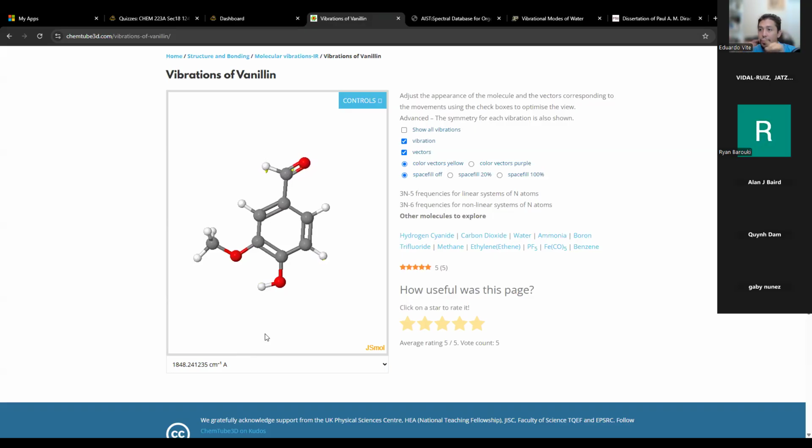And so when we look at the chart, we look at the values of those specific energies and we see if there is a peak. And then what kind of a peak? Is it a strong peak, a weak peak, a broad peak, a narrow peak, and so on.